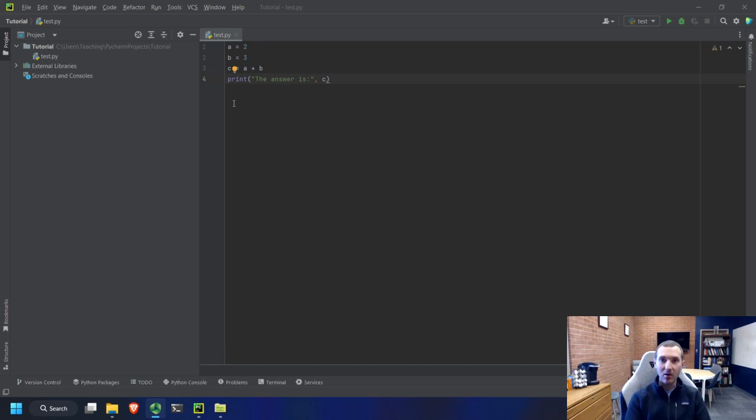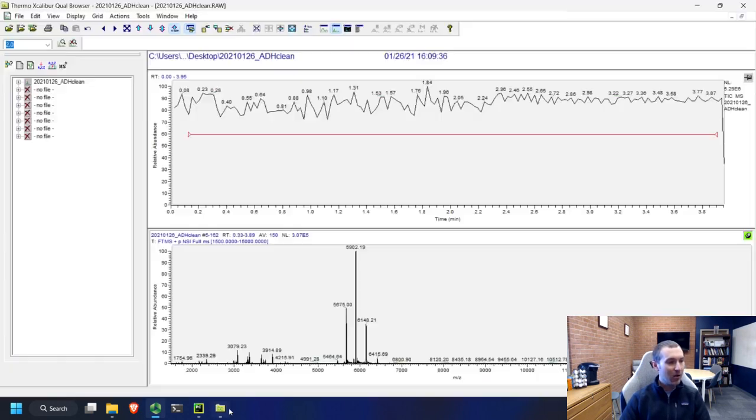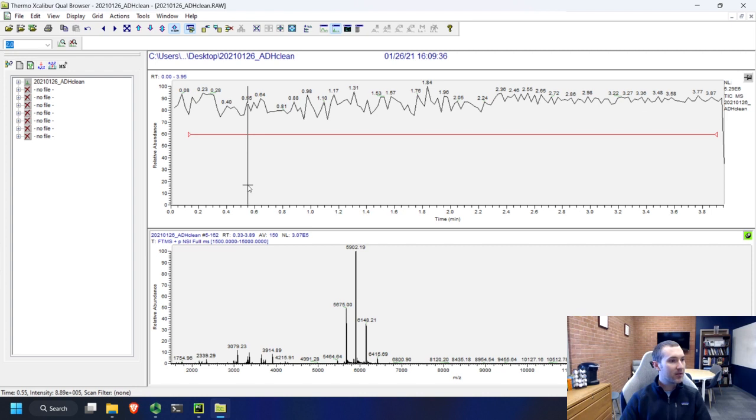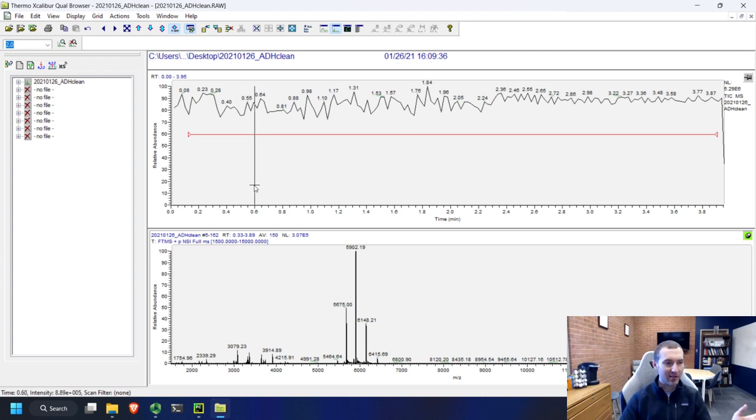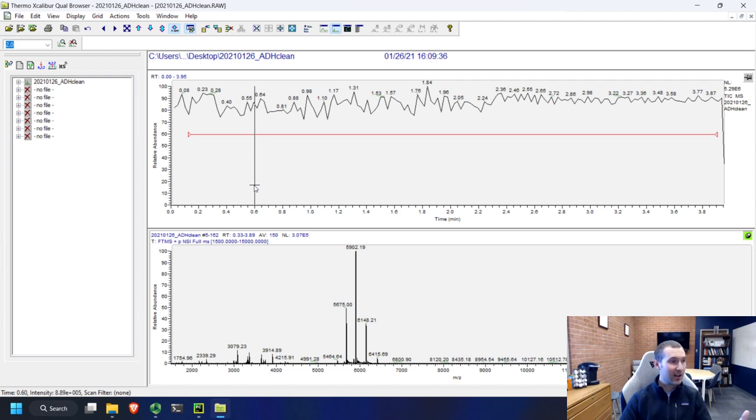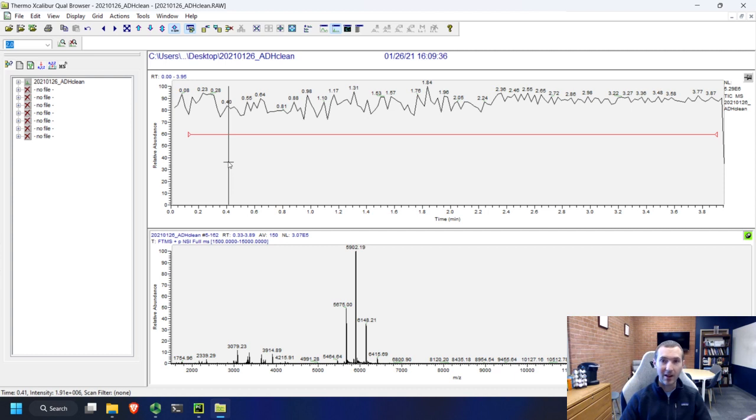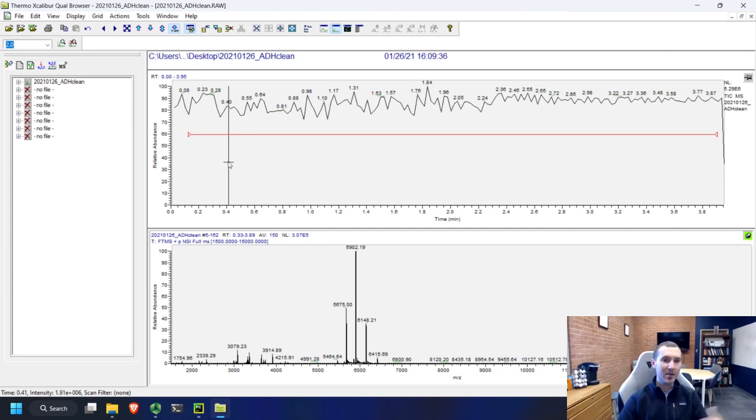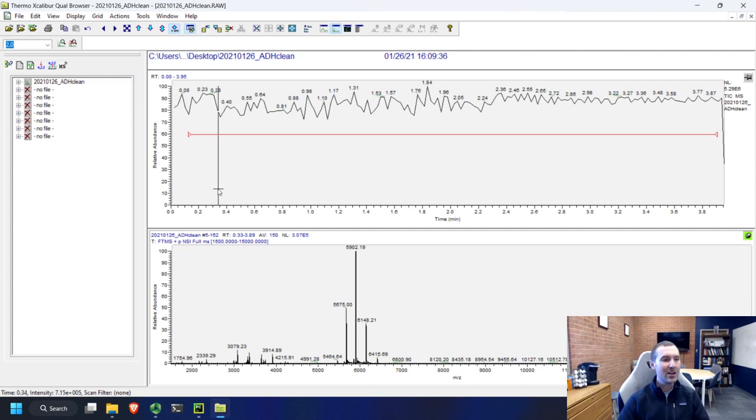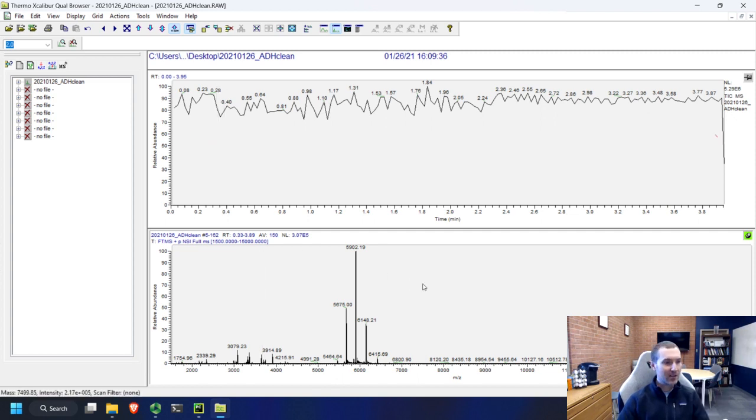So in this lesson we're going to work on learning how to load mass spectrometry data into Python. I've opened up an example spectrum in qual browser here. This is a piece of Thermo raw data. Of course you can do this with other types of file formats. There are ways that you can load things like raw files into Python directly without having to convert them. There are also ways that you can load in mzML files and we'll talk about those later.